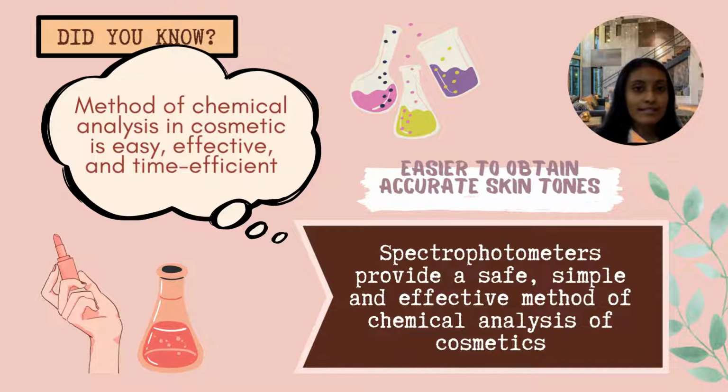Method of chemical analysis in cosmetics is easy, effective, and time efficient. Then, using color technology for chemical analysis in cosmetics allows manufacturers to create specific formulations that are free of impurities, which can then be repeatedly used for quality control. To conclude, spectrophotometers provide a safe, simple, and effective method of chemical analysis of cosmetics.